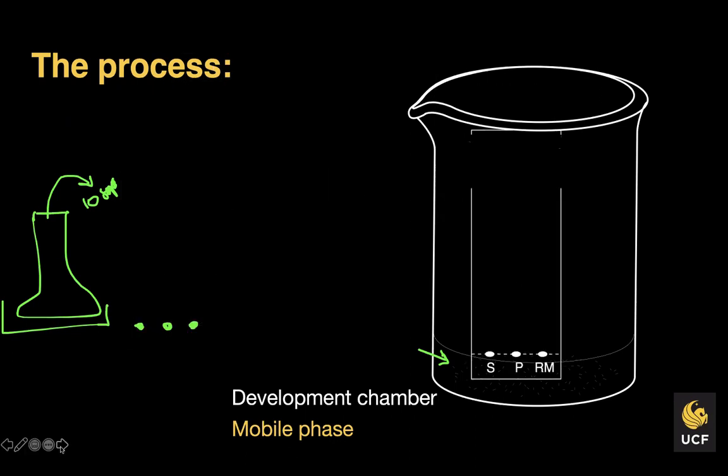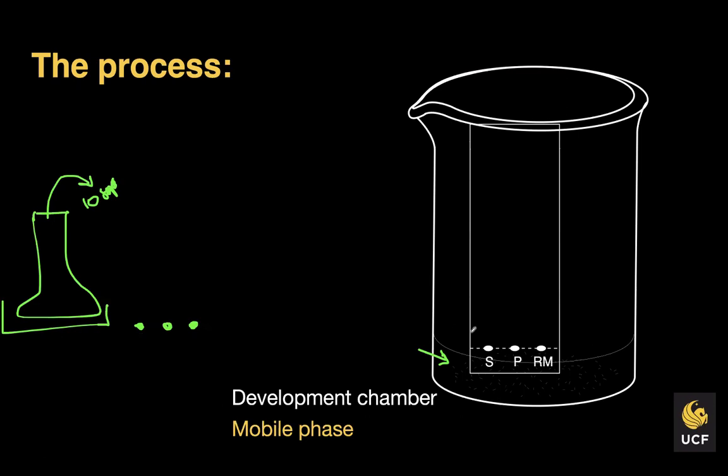We take the TLC plate and put it within what we call the development chamber, and we simply put a watch glass on top to avoid the solvent evaporating, and we watch that solvent move up the plate, right? You watched it in the video and it was timed fast, but you saw it move up the plate. Once it moves 50 to 75% up the plate, you can remove the plate, and right away you want to mark where the solvent line is.